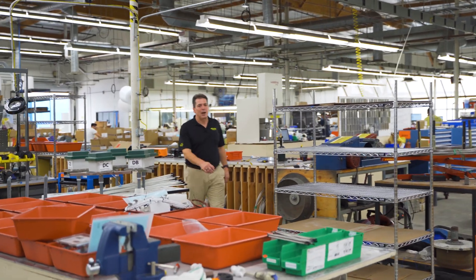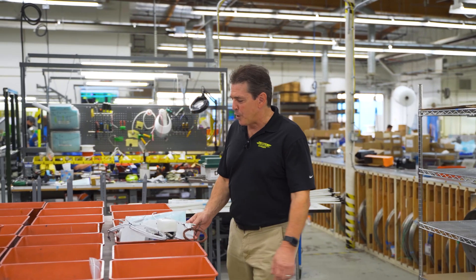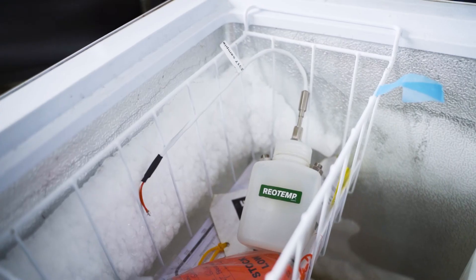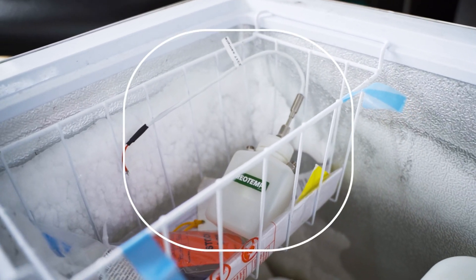Helping customers manage critical temperature measurements is what we do. Here's an order for a local pharmaceutical company who's developing antiviral therapeutics. In lab environments, it's critical to keep samples, specimens, cultures, and other products within a tight temperature range.